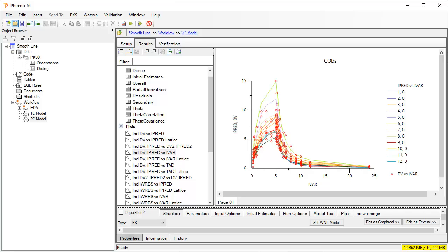Phoenix PK model output of predicted concentration versus time might in some cases display predicted lines that do not appear smooth. This can be clearly seen in the predicted profile for subject 4 in green in this example.